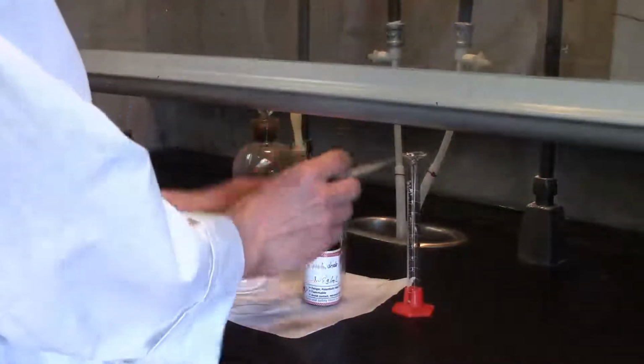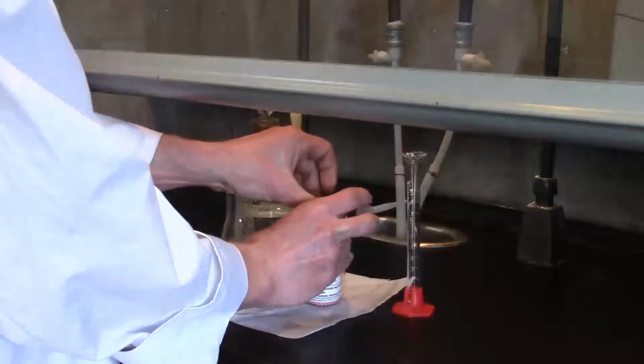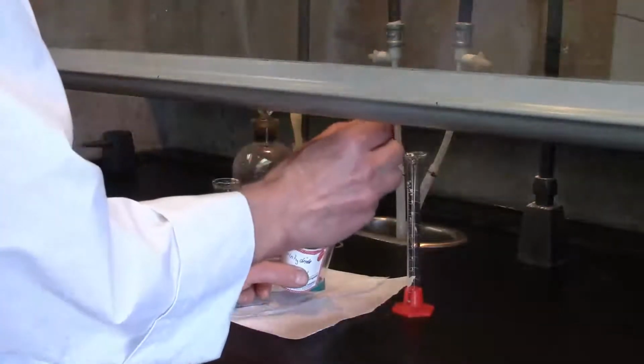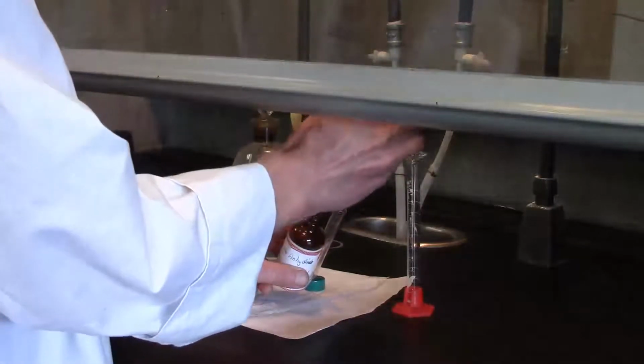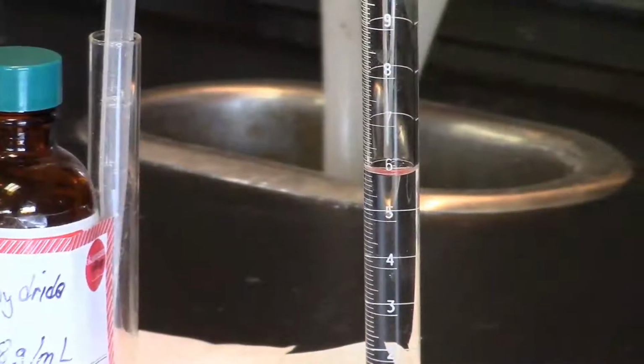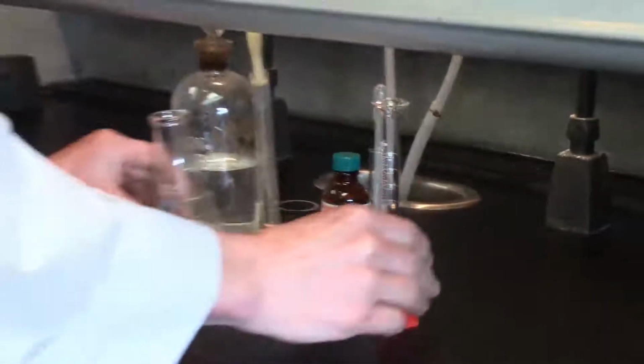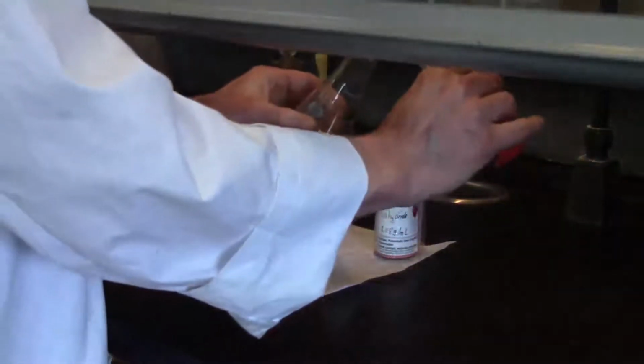Now understand that the acetic anhydride is in excess. So I'm going to aim for 6 mL. If I end up with 5.9 mL or 6.1 mL, it's not a big deal. And I can see that actually I'm very close to the 6 mL. So I'm going to add this now to my salicylic acid.